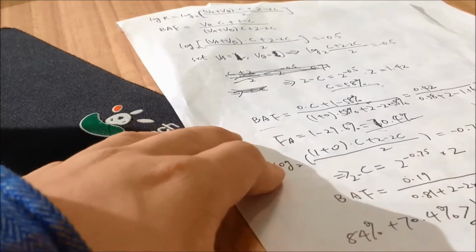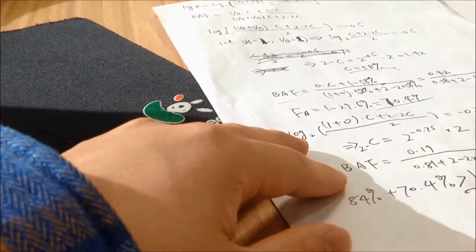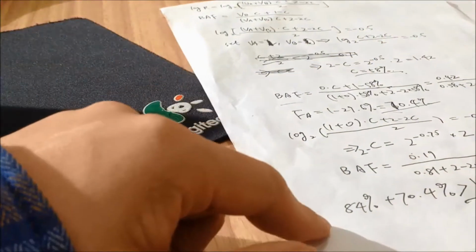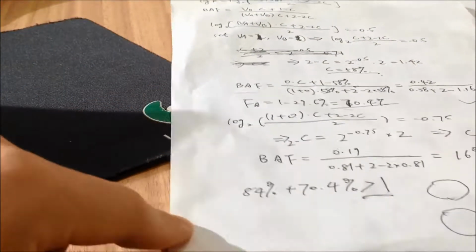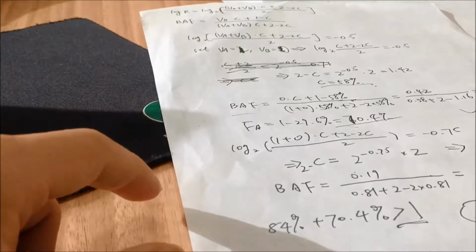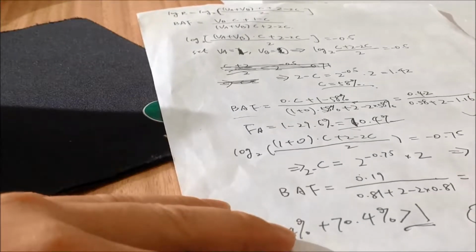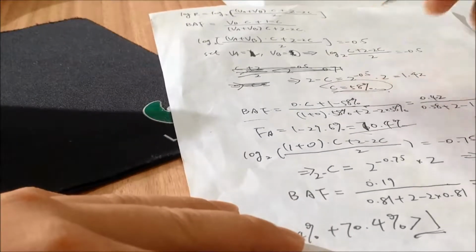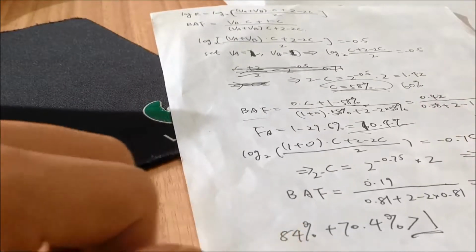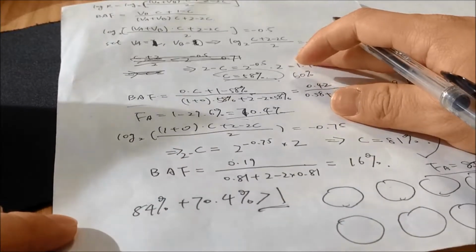So we can sort of draw the behaviors of the two chromosomes. We suppose that the clonality of the cells that lost a copy in chromosome 14 is about 80%, and then the clonality for the other is about 60%, for the lost copy in chromosome 2.